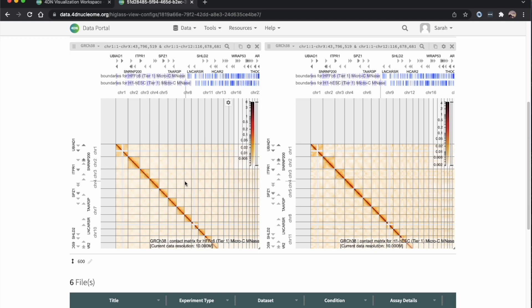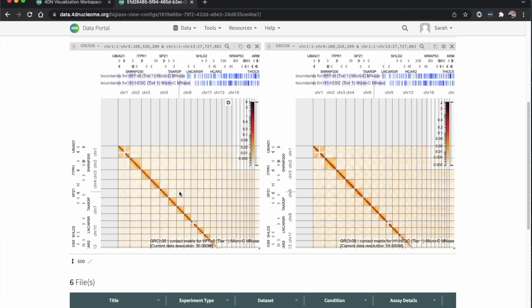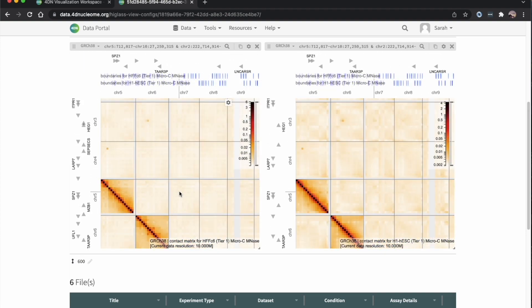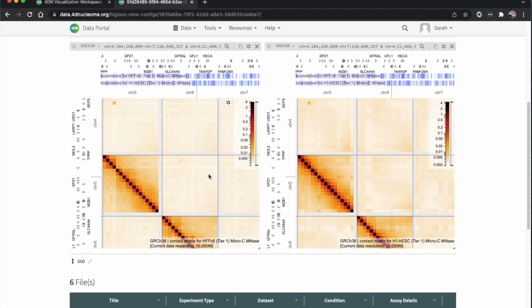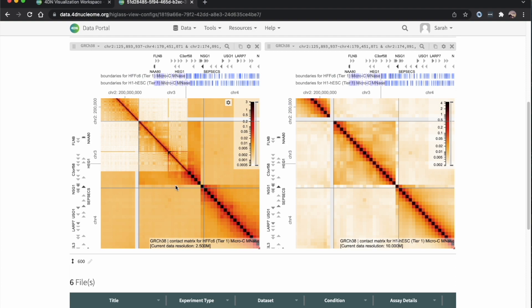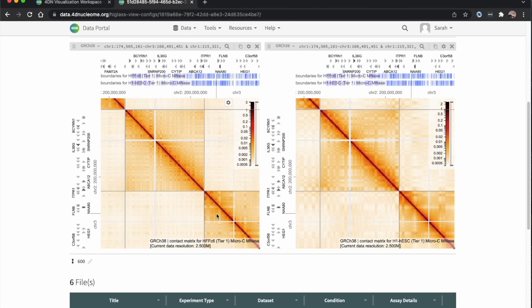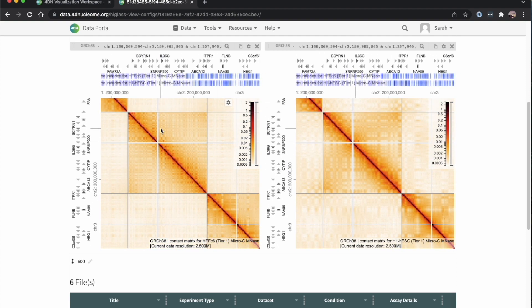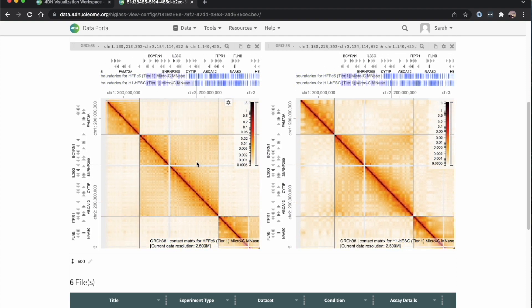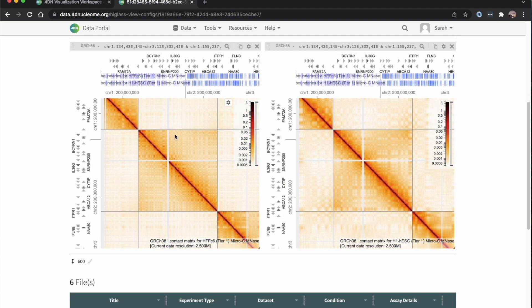If you haven't used HiGlass before, you can use the middle mouse button to zoom in or out. As you do that, the resolution will change. You can click the mouse and drag around to look at different parts of the contact matrix.